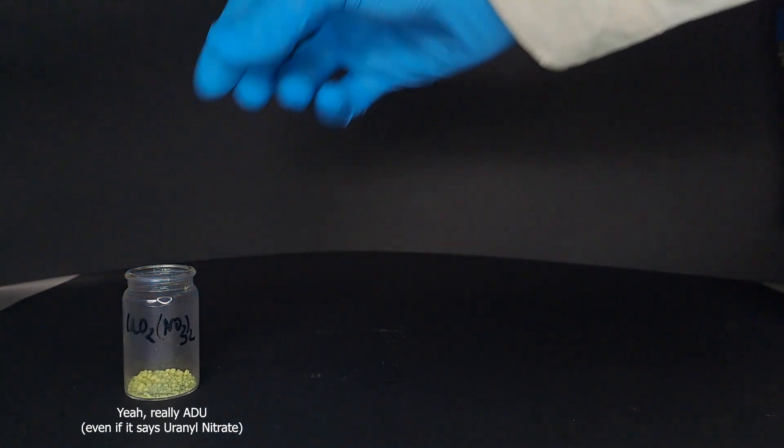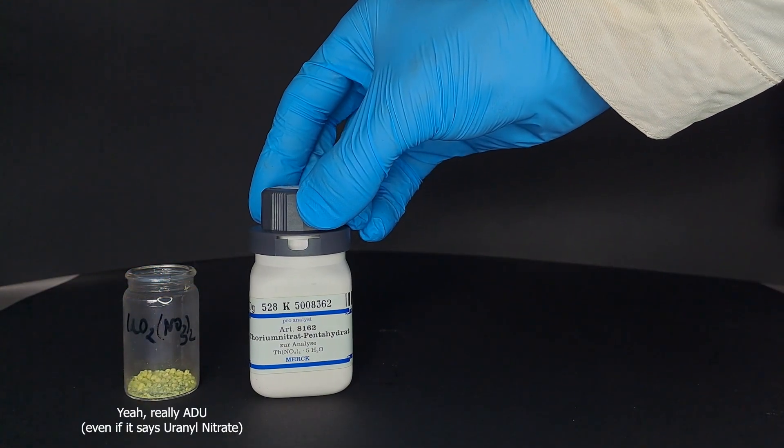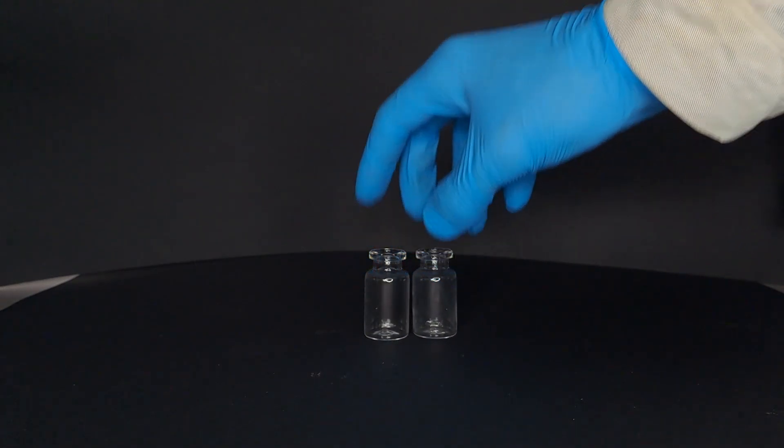However, what we do have is larger quantities of ammonium diuronate, thorium nitrate, and concentrated hydrochloric acid. As for equipment, we need two containers, a spatula, a syringe, and some creativity.